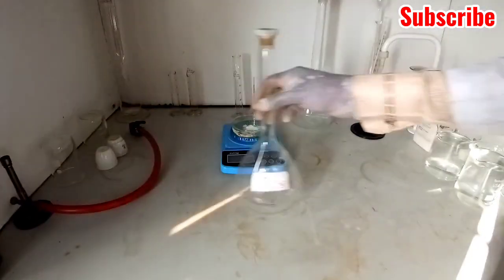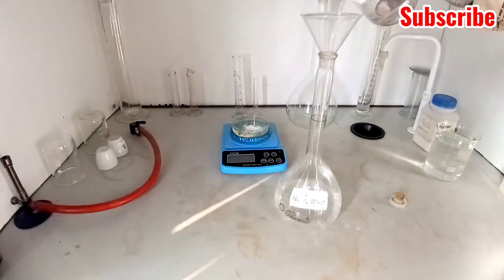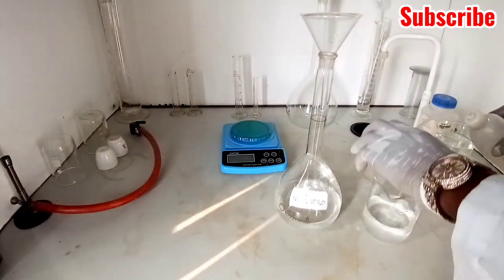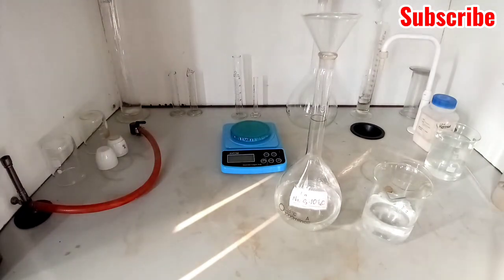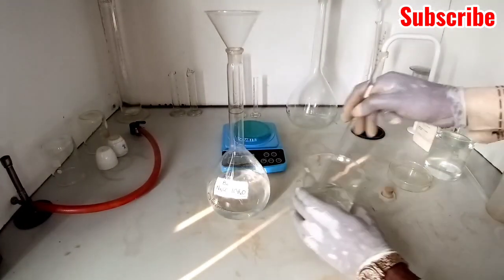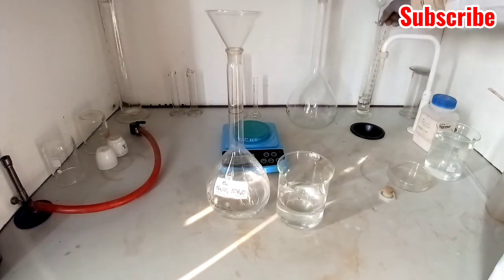So we'll go further. First, you dissolve in water, then you dilute to 1000. Don't just pour 1000 and add the solid to it, it will increase the volume; rather, dissolve it in water first, as you can see what I'm doing. Dissolve in water, you stir, ensure it dissolves properly. It's highly soluble in water, so that won't be a problem.